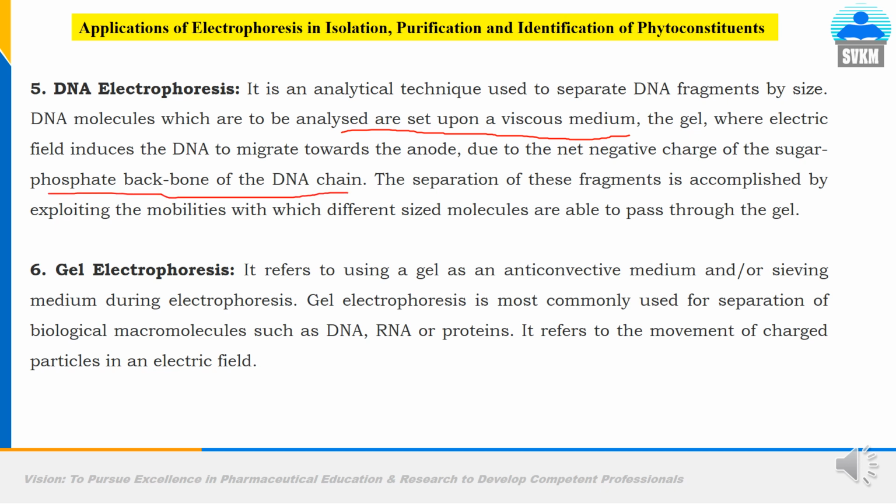The separation of these fragments is accomplished by exploiting the different mobilities with which different size molecules are able to pass through the gel.